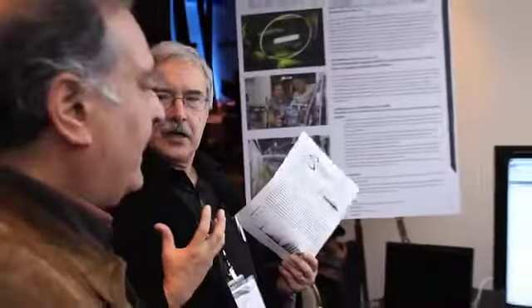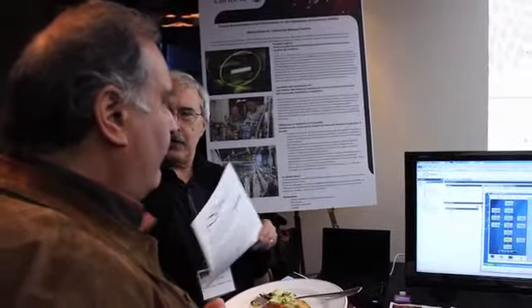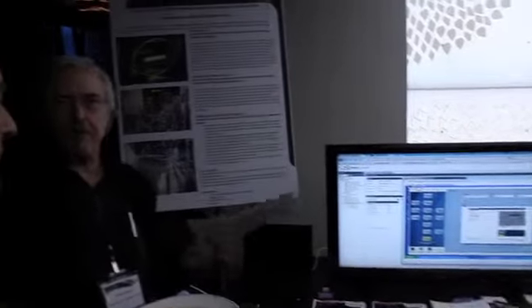Are there applications for this that you see outside of the scientific community? Yeah. The way Science Studio is designed, it's basically an environment for running experiments with remote control of devices. So in principle, you could also have it interface to an MRI or a CAT scan. You could have somebody remotely operating it, collecting the data, and doing the analysis. Again, if the device is remote, you'd still need somebody there to put a patient in or a sample or whatever, but you don't have to have all the people physically there to collect and look at the data. There are other applications as well. We're looking at some applications in terms of training, providing access to devices that can be used by students in engineering laboratories, so that institutions that can't afford the equipment could do this. And then you end up with the concept of real-time analysis and feedback, which just augments the whole process.